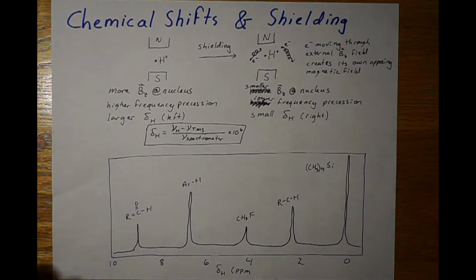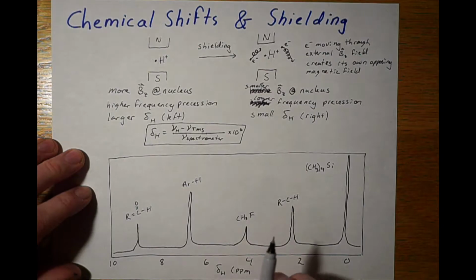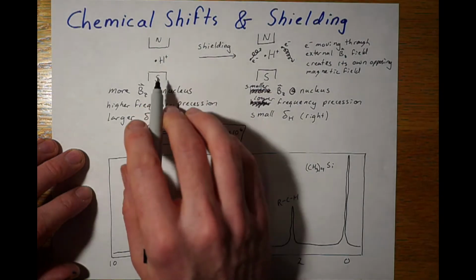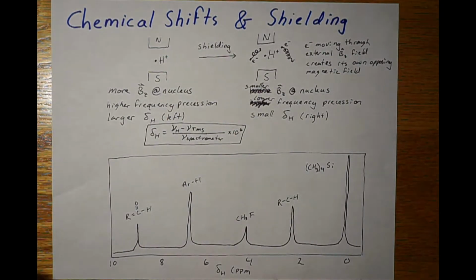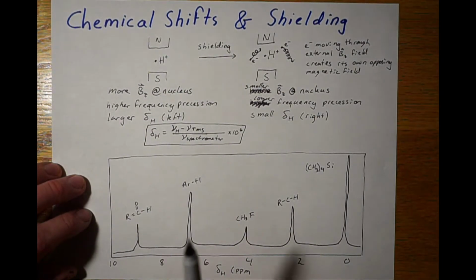One of the ways that we can use NMR to help us understand molecular structure is through the different peak positions or chemical shifts that can show up as a result of the different chemical environments that protons can exist in, also known as shielding. So if we imagine a bare proton in a magnetic field, this will experience the imposed magnetic field, Bz, and we'll have a splitting of our spin up and spin down states accordingly.